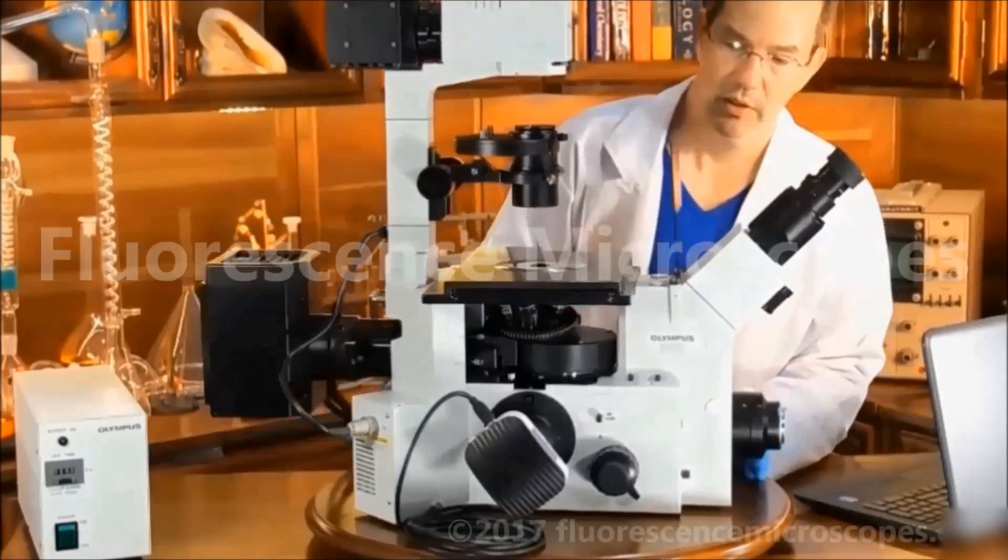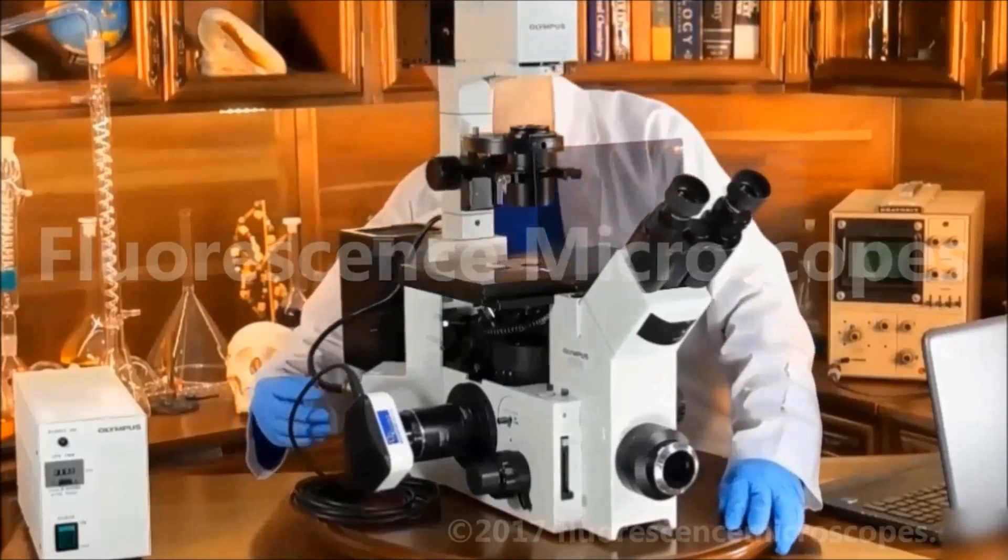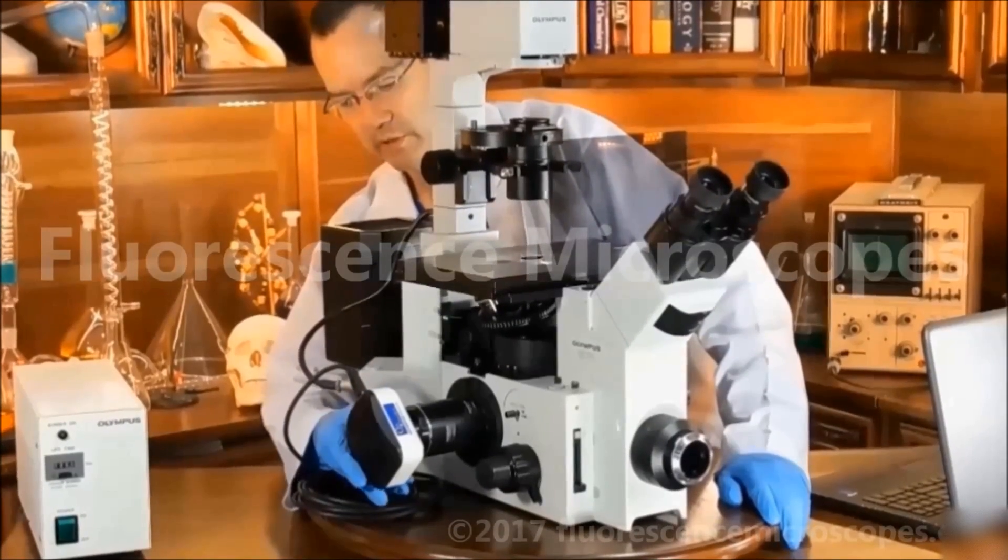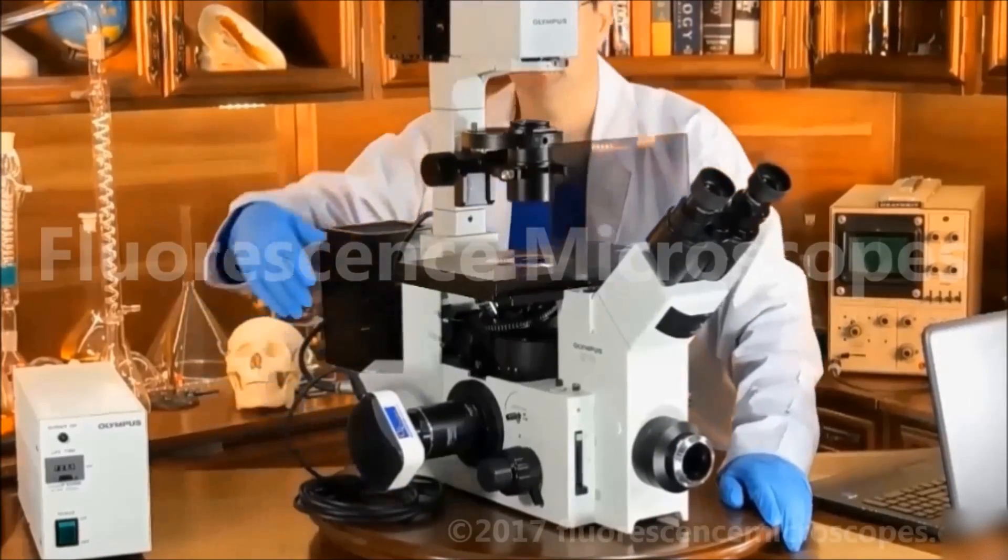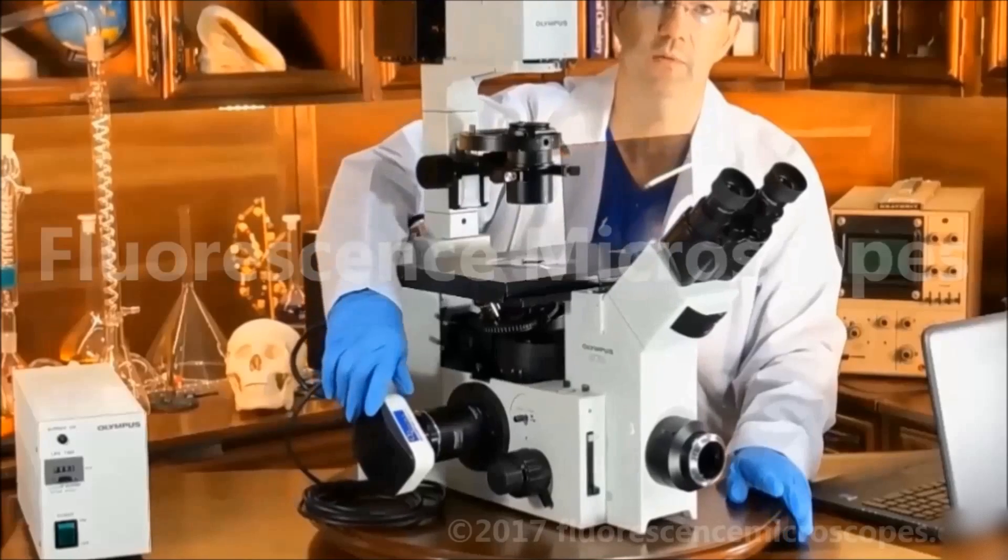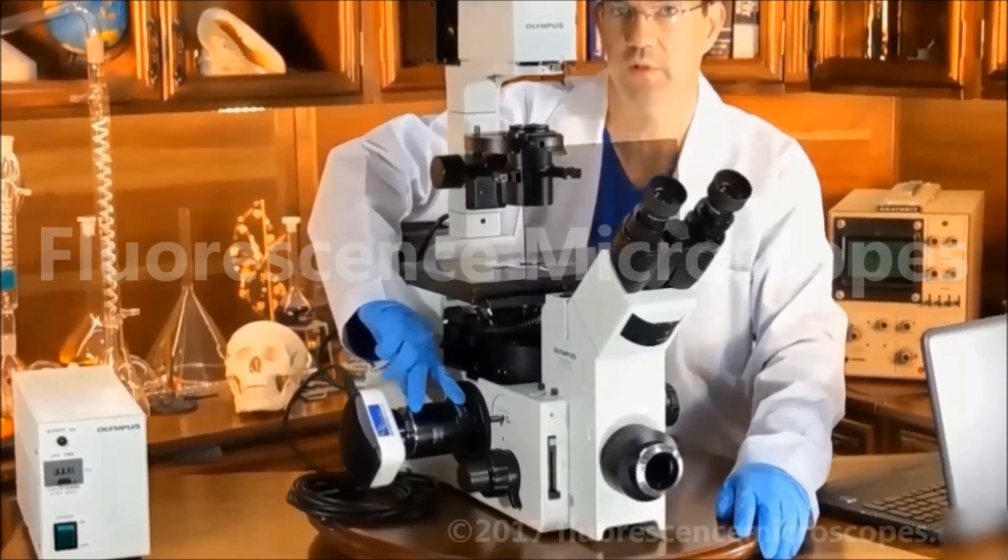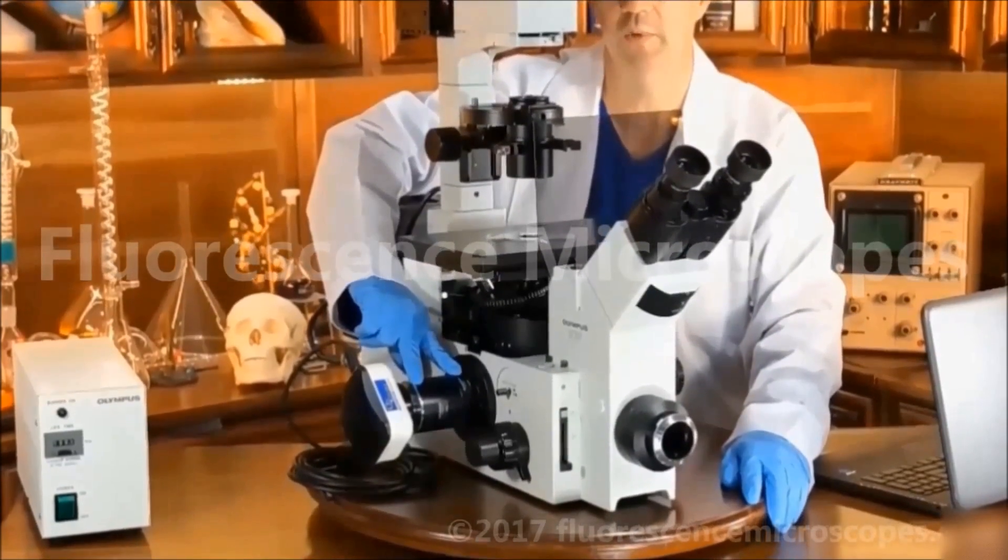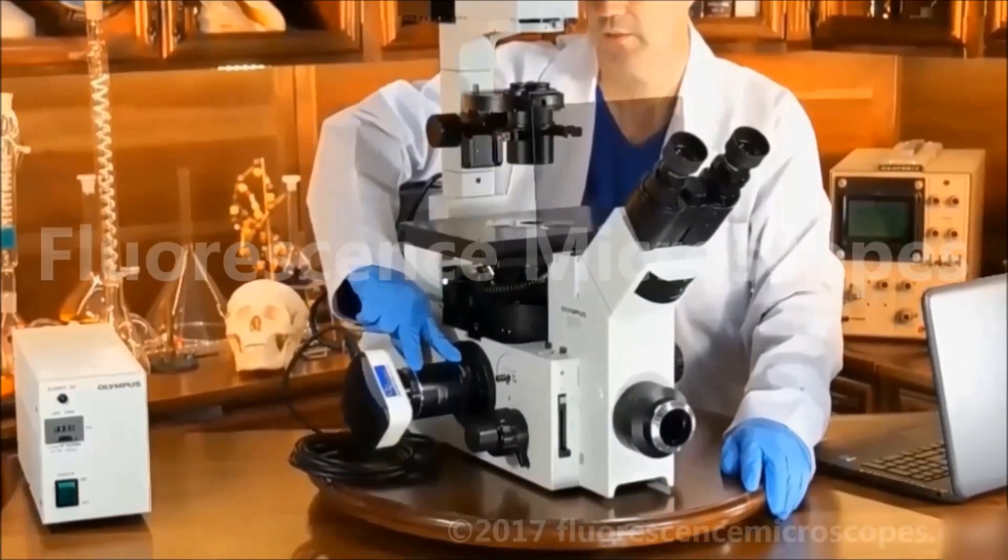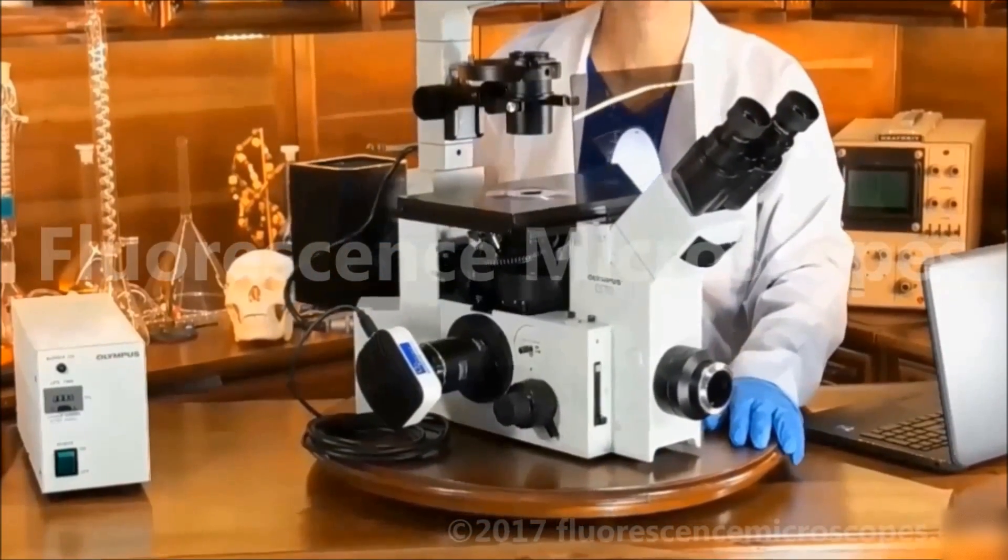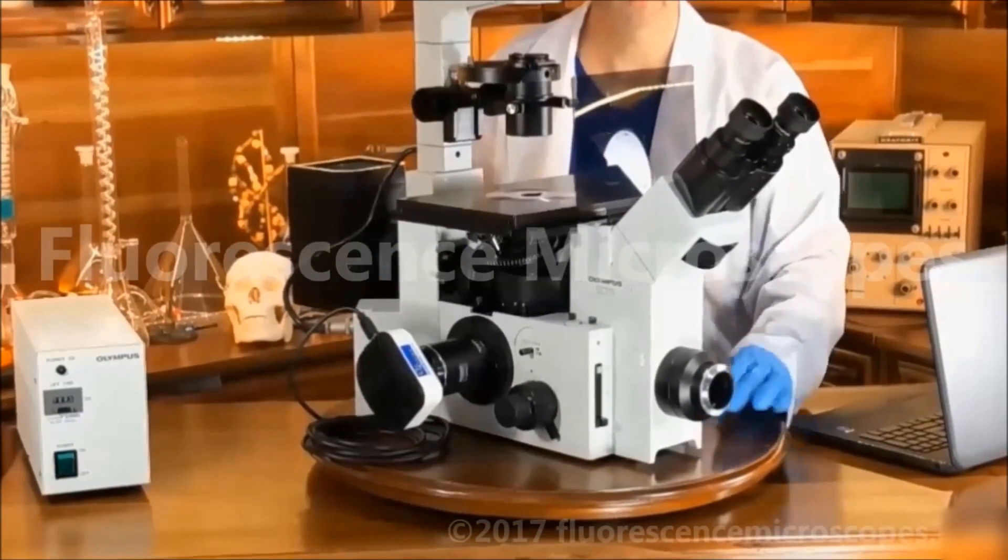We are showing a camera on this microscope. This may or may not be included. You'll have to look at the ad to see what particular camera is included, if any. We are including the C-mount attachment with the microscope. All that will be detailed in the specs of the ad. The bottom line is that this microscope is capable of taking photographs with the right camera.